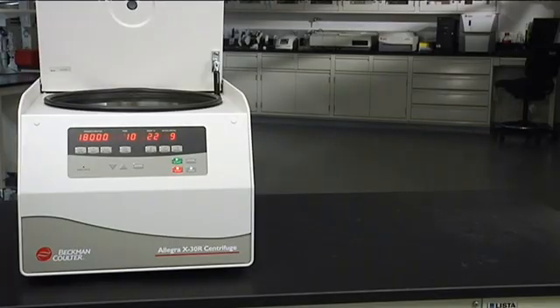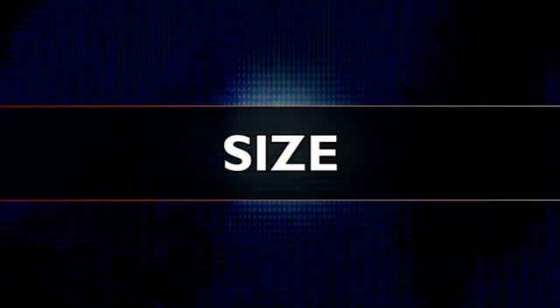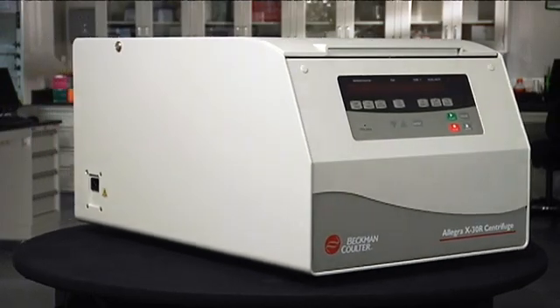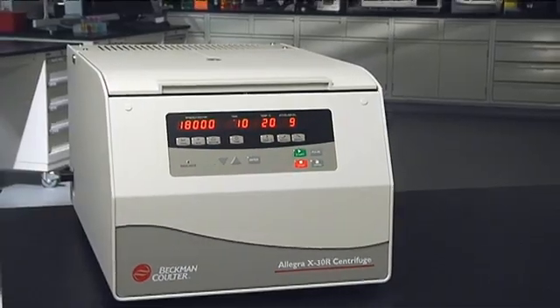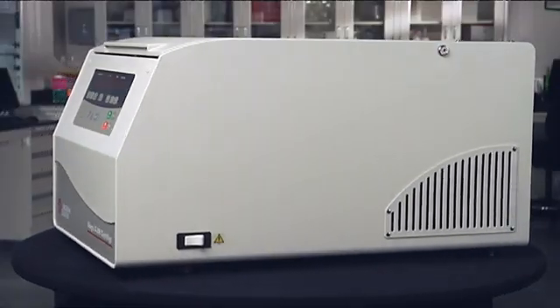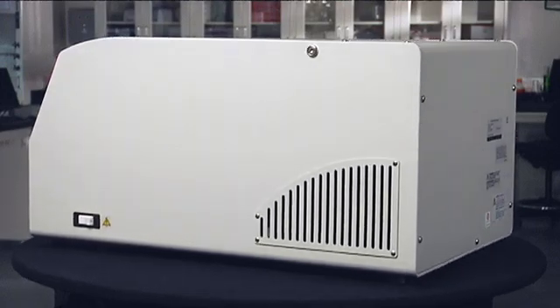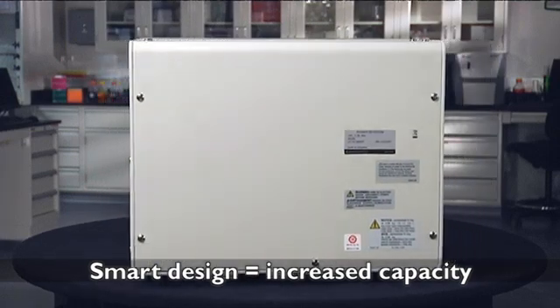Beckman Coulter saves you time and bench space at an affordable price. Excellent performance and easy operation combine with a compact design to make the Allegra X30 a smart choice for efficient workflow and bench space optimization. The Allegra X30 Series offers the smallest footprint of its class, adding more output without taxing your lab space. Our refrigerated models have a rear cooling unit, giving you 30 to 50% width savings on the bench compared to similar instruments. And the X30 smart design delivers increased capacity up to 1.6 liters.